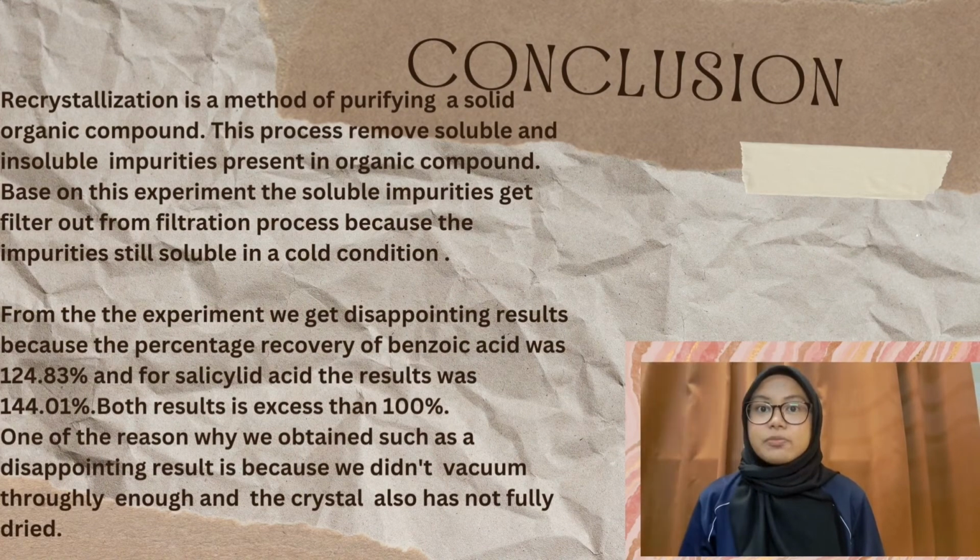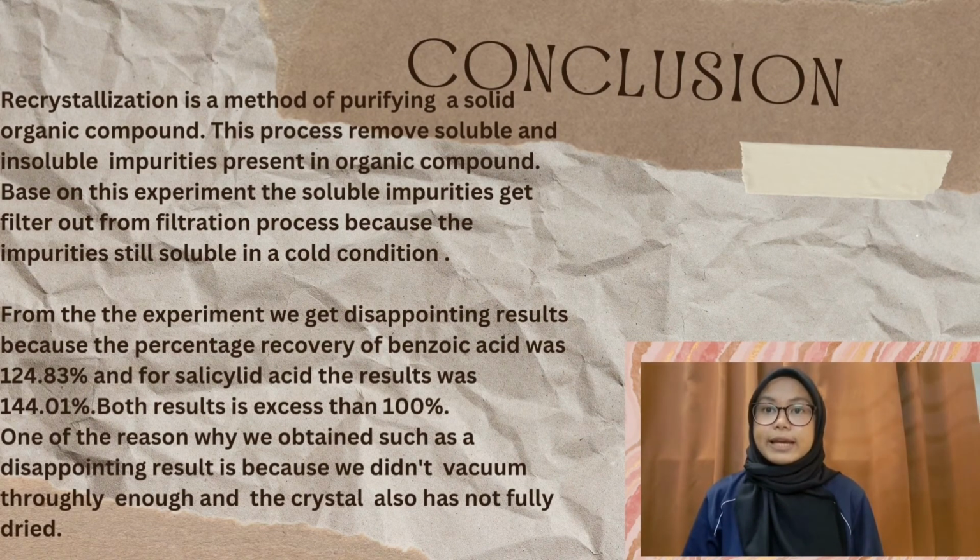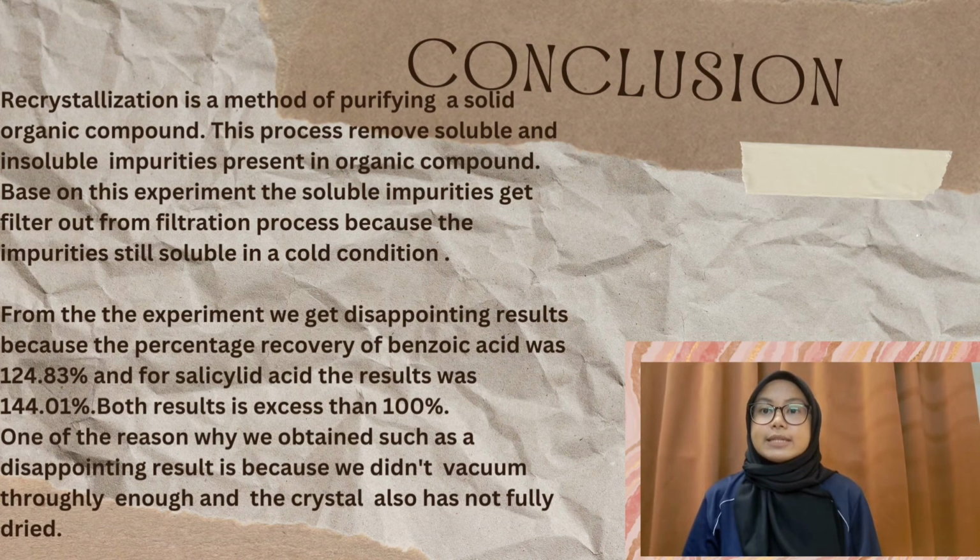Recrystallization is a method of purifying a solid organic compound. This process removes soluble and insoluble impurities present in the organic compound. Based on this experiment, the soluble impurities get filtered out in the filtration process because the impurities are still soluble in cold conditions.